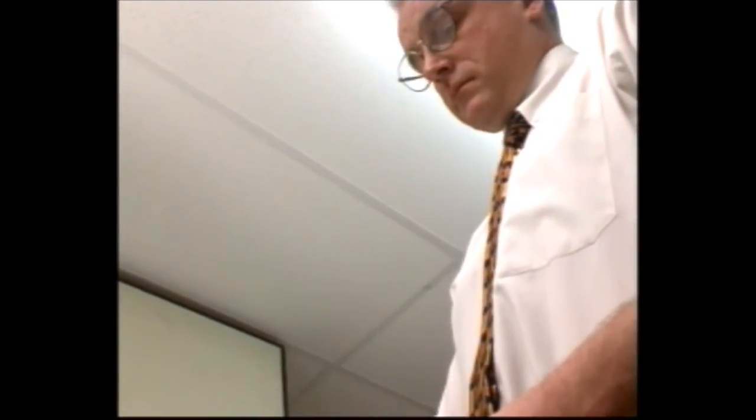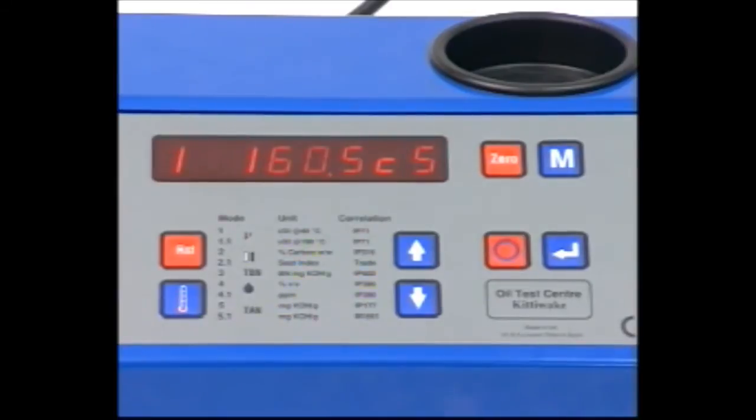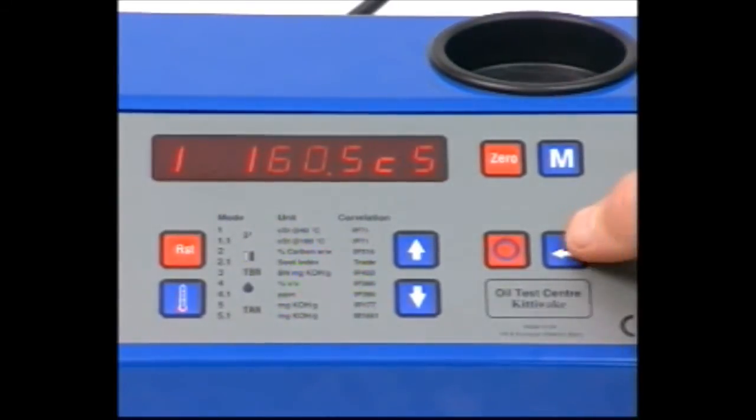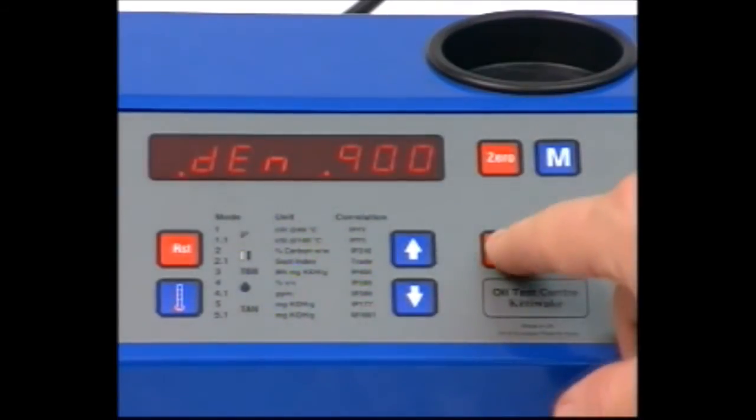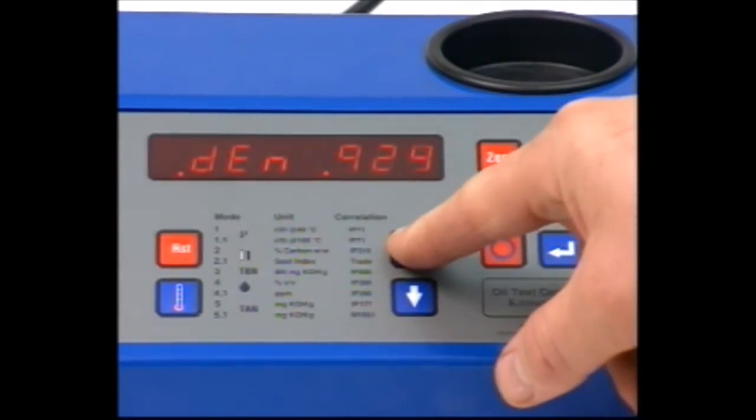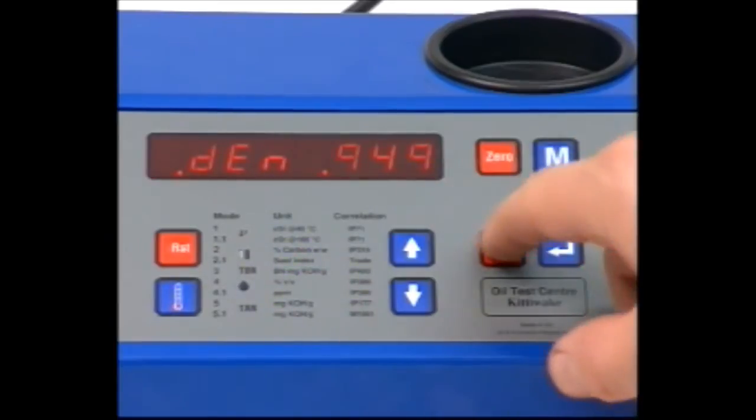If you are testing an oil which has a different viscosity index or density to that of a normal monograde oil, take the viscosity reading as shown. The default setting for oil density used by the viscometer is 0.9. To change this, press Return and enter the new value with the speed and arrow keys.